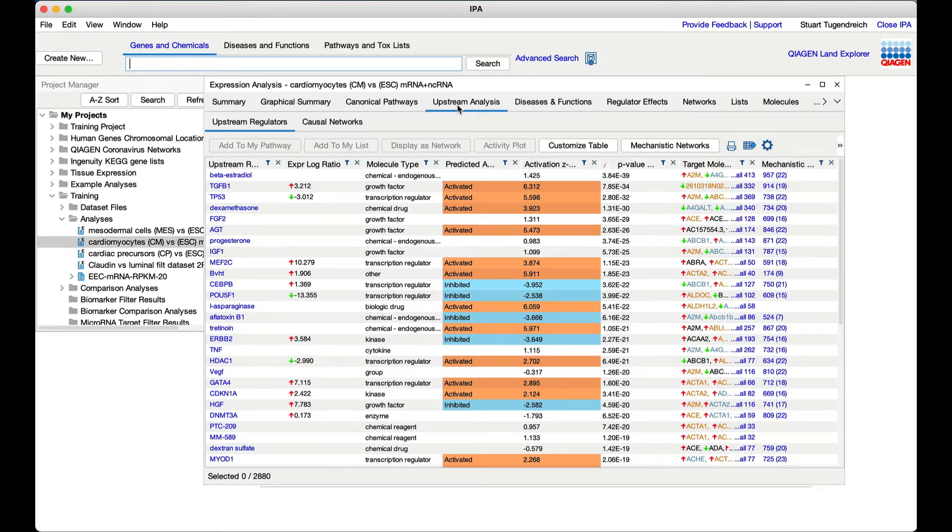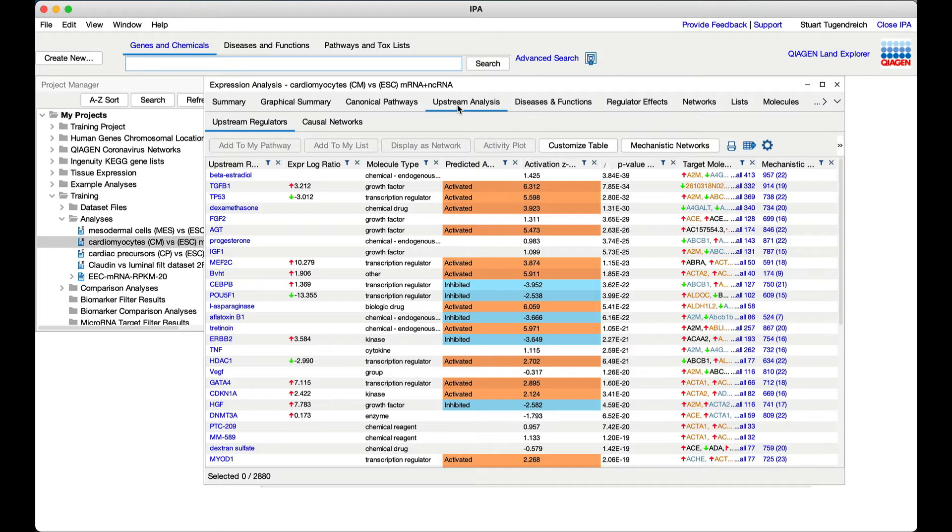The regulators in this table can be any type of molecule. The only requirement is that the knowledge base has findings from the literature that describe how that molecule regulates the transcription or expression of molecules downstream of it.